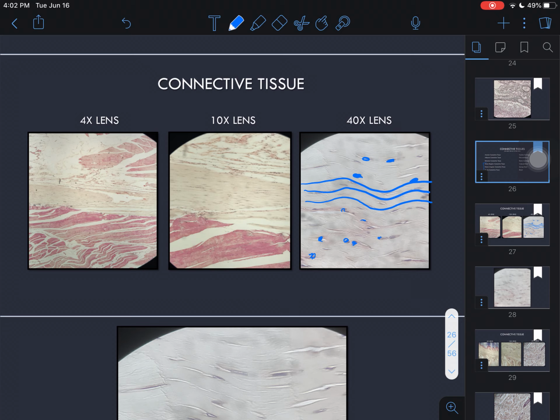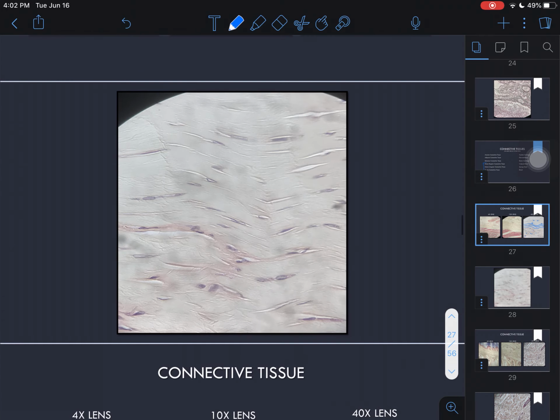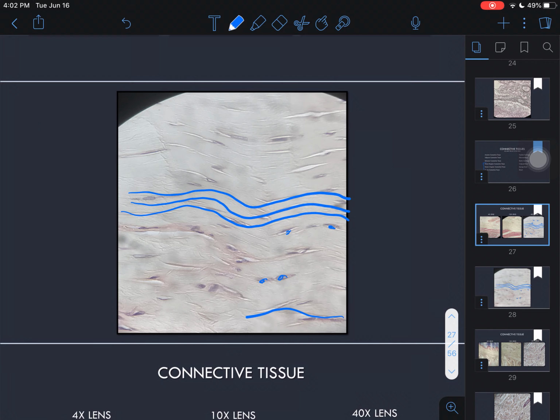Notice it's much clearer than our non-keratinized stratified or our transitional, but it almost has that same type of look. Okay, here's the close-up again, our nuclei, and we see this nice wavy pattern, but it's pretty regular, right? It doesn't change that much as we come down.